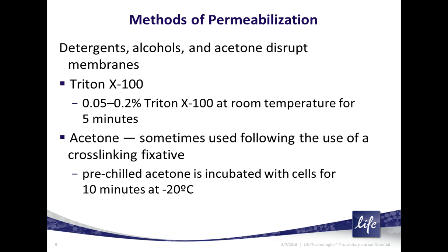Sometimes you'll see in protocols the mention of PBST, which is phosphate buffered saline with Triton X100. A typical time for the permeabilization with a detergent could be as short as 5 minutes. I typically would go 10 to 15 minutes.